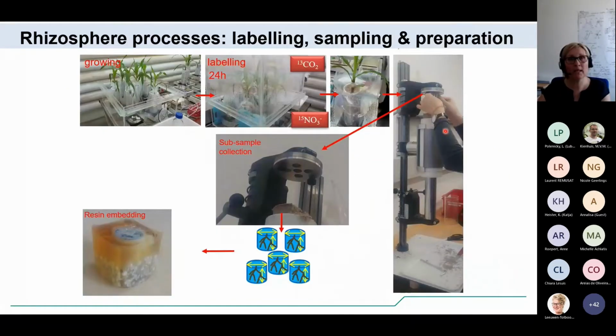However, more complicated things come when you get soil or sediment into play, and the sample preparation is anyway difficult, because you need to ensure not only that the object of your study is growing well, you need to ensure a decent labeling experiment, that you are sure that your tracers would be assimilated into the plant and microbial biomass during the time you chose for the experiments, as well as that you have representative subsamples collected with artifact-free, if possible, sample preparation and collection.